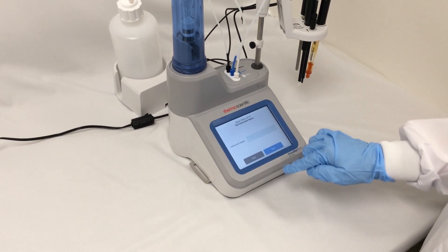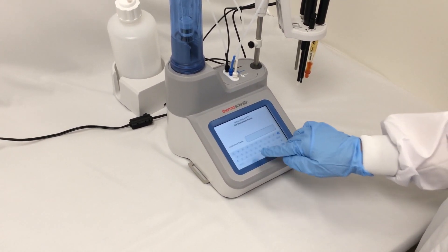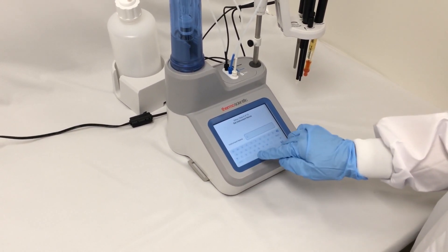I'll select my temperature units. And then if I want to, I can give my instrument a name — so I'm just going to call this one lab.